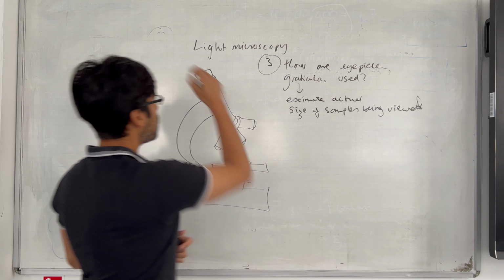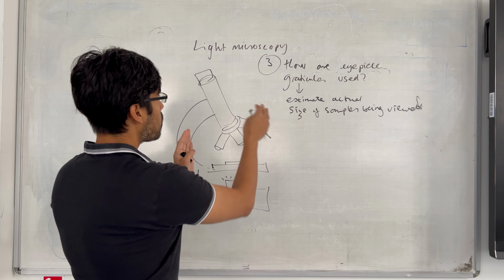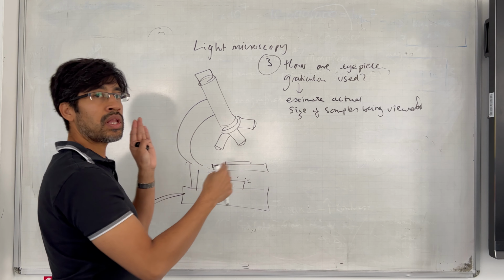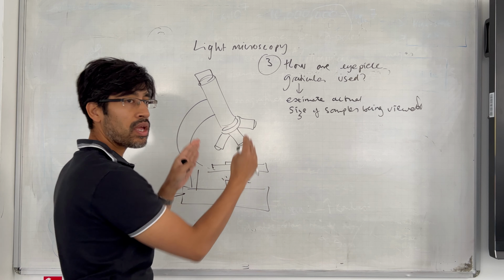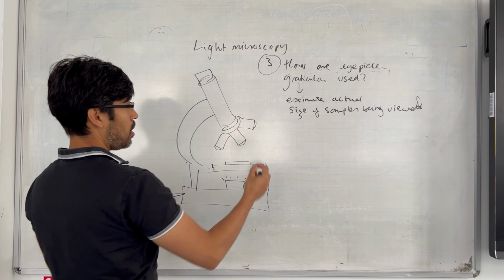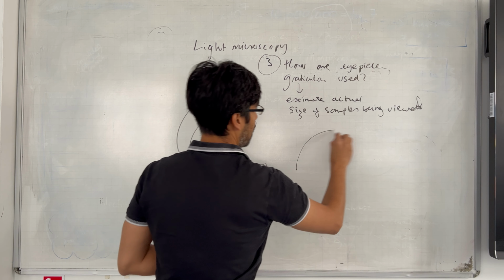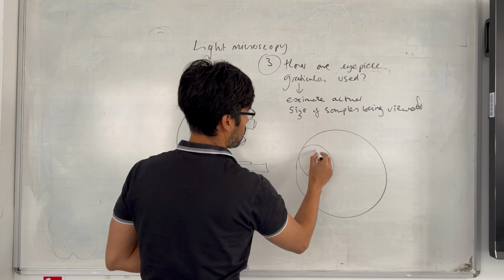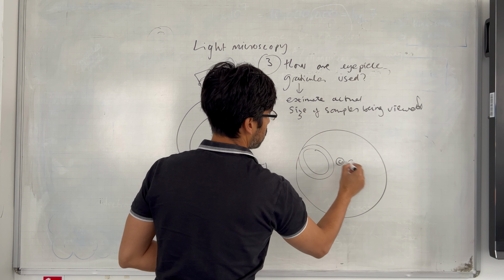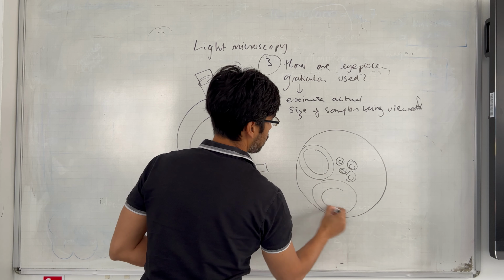All right, so if you're looking under the light microscope and you're looking at a xylem vessel, the presence of the eyepiece graticule should allow you to estimate how wide that xylem vessel is. Okay, so let's say I am looking down the sample and I'm looking at my cells. Okay, right, of course, some cells. It's a terrible biological drawing. Okay.